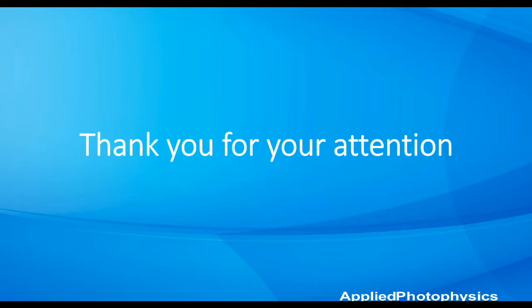Thank you very much. Another viewer writes in, do you mean that CD spectroscopy is unique among other spectroscopic ways of protein analyses? We commonly apply such procedures to HPLC-based chemical analyses. So thank you again for that question, and I'm glad I have the opportunity to clarify. No, I do not mean that CD is unique in this context. In fact, much of the presentation that I went through today would be equally applicable to other types of methods, and not just spectroscopic methods, but chromatographic methods and other characterization methods as well.